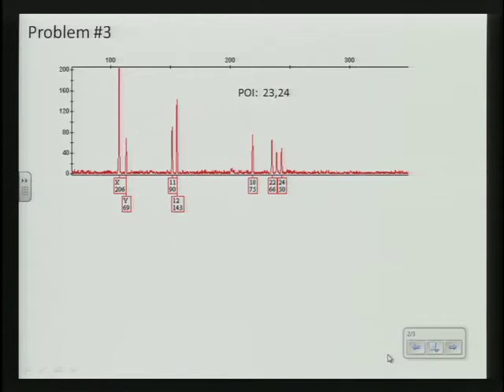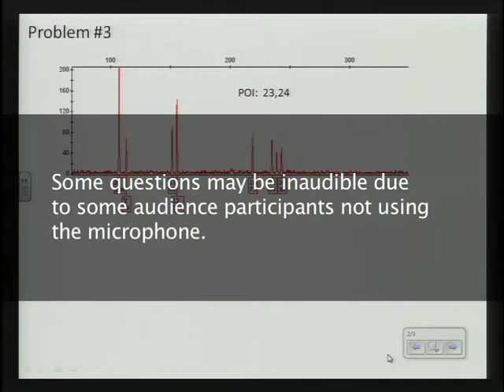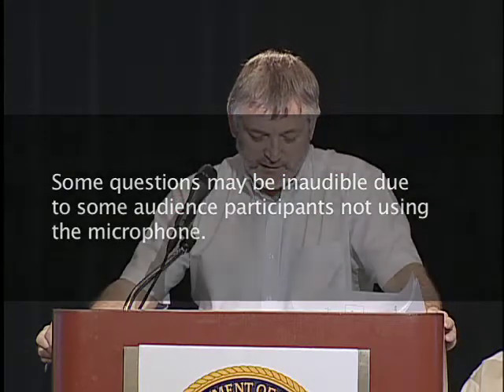Can I ask you a question? Okay, we've got one, our 24 allele is at 50 RFU. What's the 23? I don't know, it's not been scored, what, 49? So does it suddenly not exist because it's at 48 or 49 when the 50 has been scored?